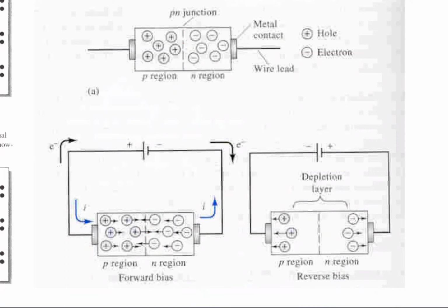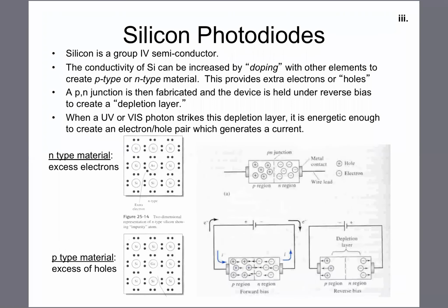Now, that's all interesting, I guess, from an electrical point of view. And actually what I'm describing is how an electronic device called a diode works. You basically forward bias it, and a diode's like a switch. It turns on or off. If you forward bias it, it turns on and can conduct current, as it turns out. But here, what we want to make is what's called a photodiode. Is that different? Indeed it is, because it's a light detector.